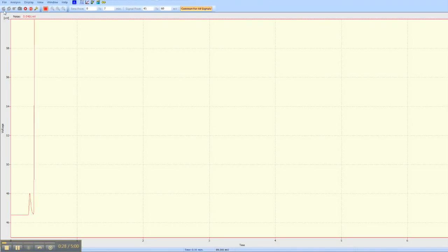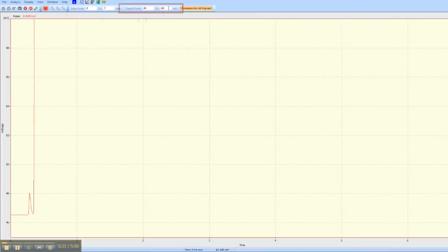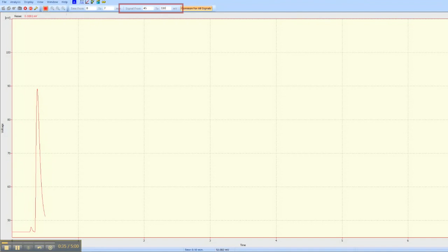If your signal goes off screen, you can adjust the Y axis with the menu on the top. Wait until the entire sample has run through the column.